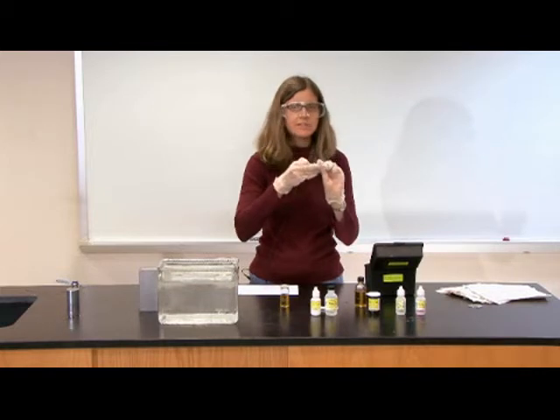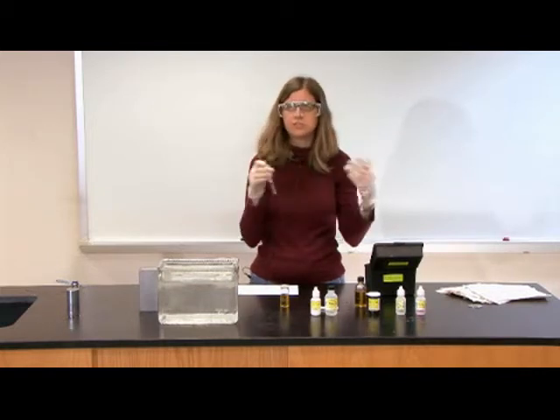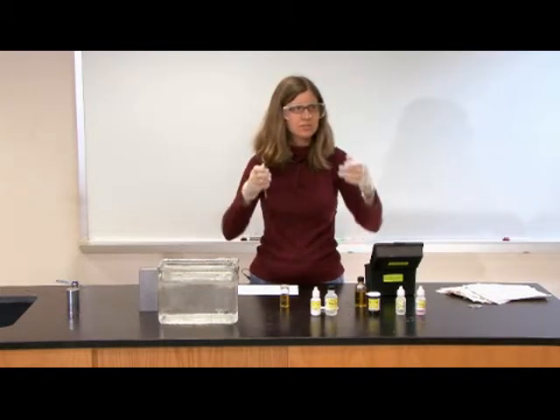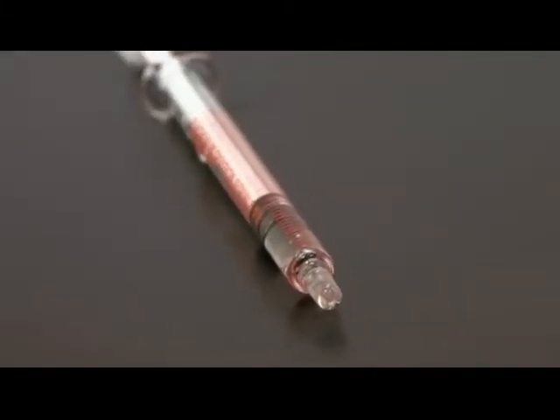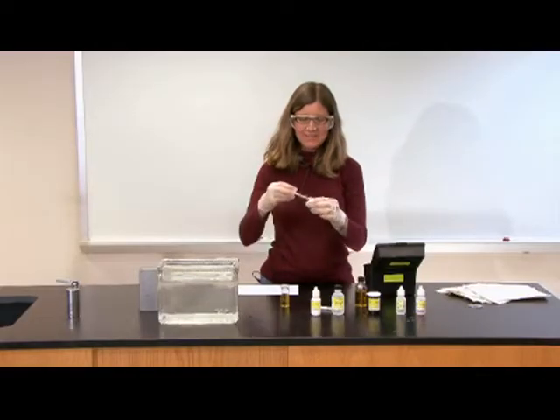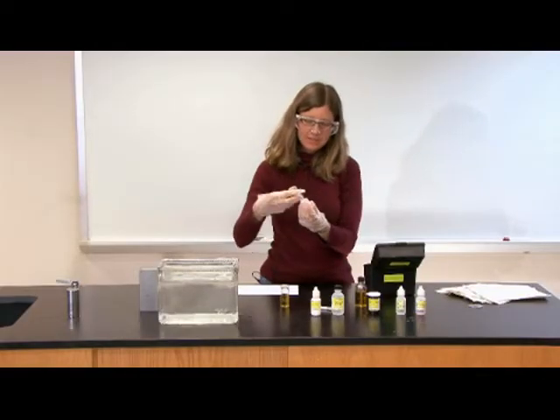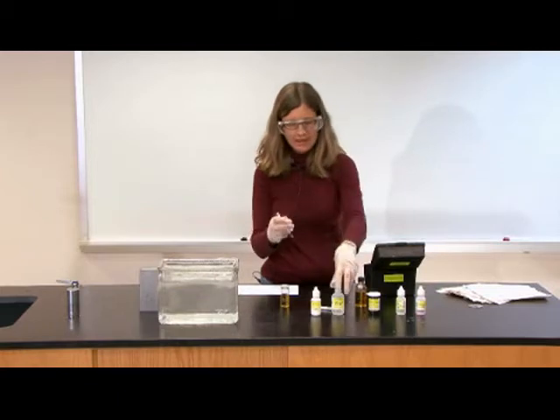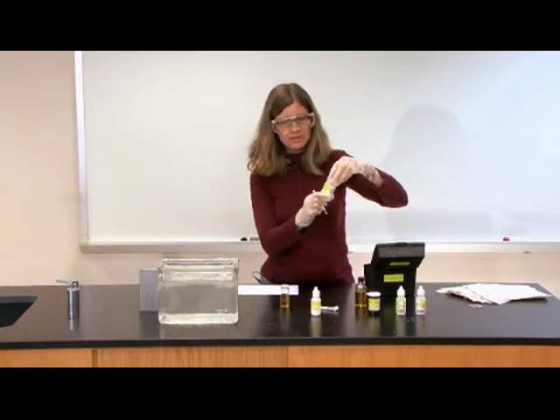It looks like a syringe. Essentially we're doing a miniature titration. Students think of a titration as a chemistry lab where you have this big pipette. This is basically serving as that pipette, so we're doing a very small scale titration here. I'm going to take my titrator, and I'm going to make sure it's pushed all the way in.